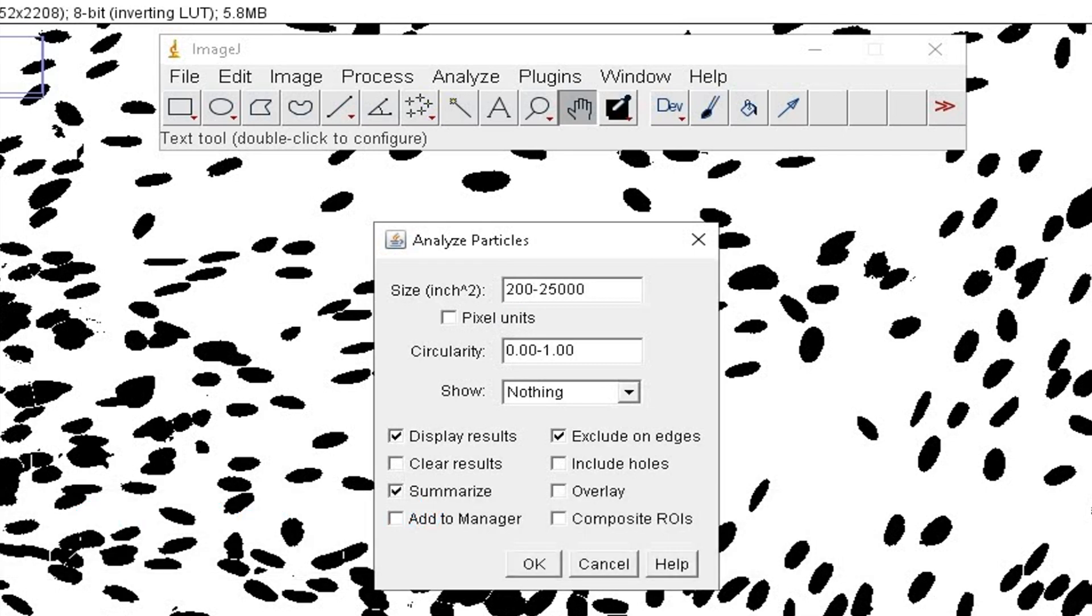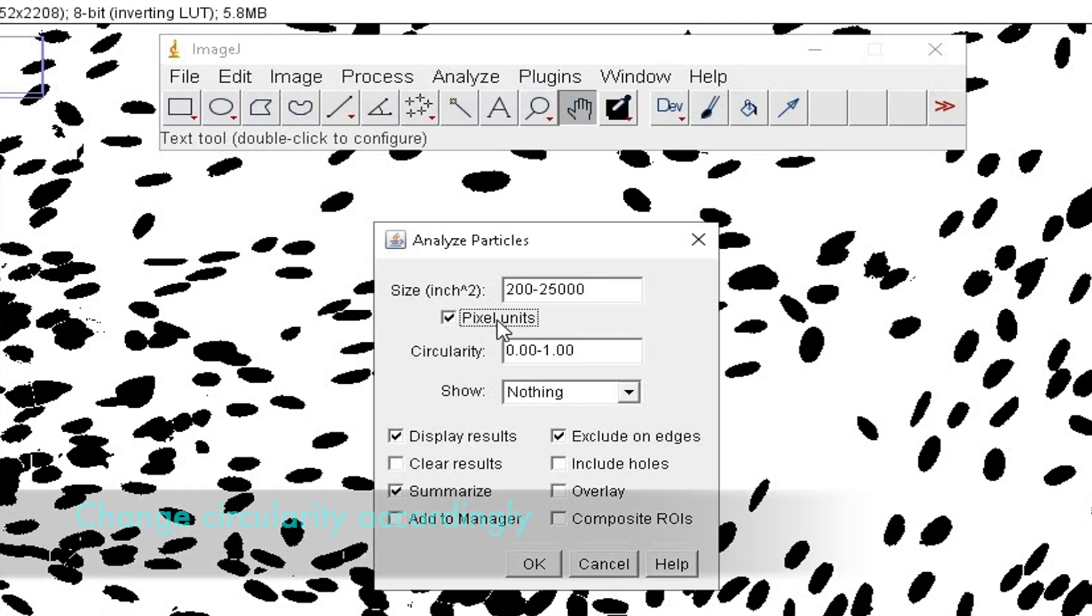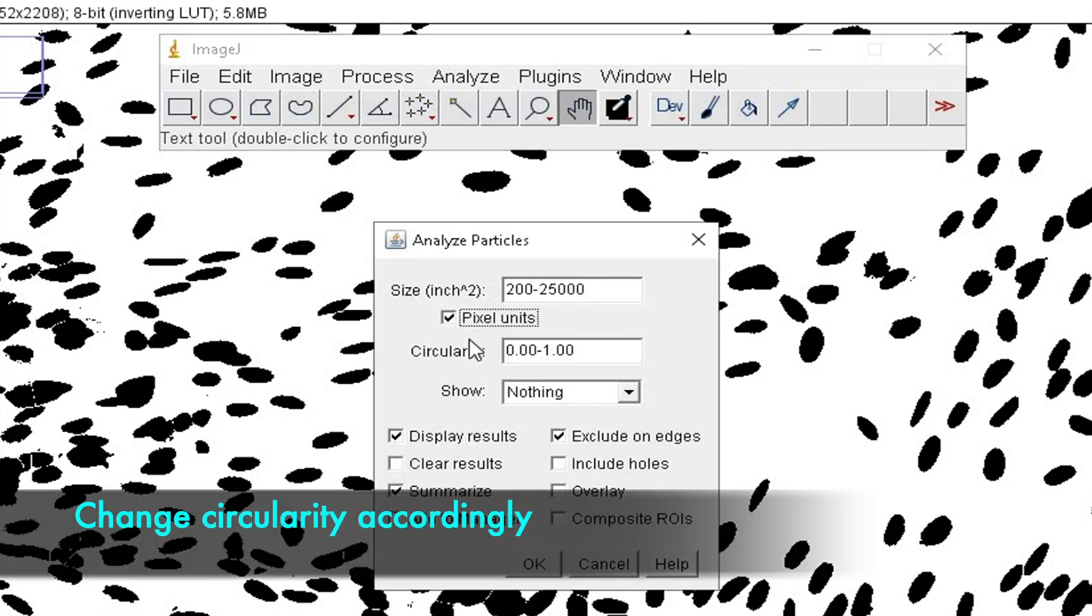And, check on the pixel unit unless you would like to measure the size in incest. You can keep the circularity from 0.4 to 1.